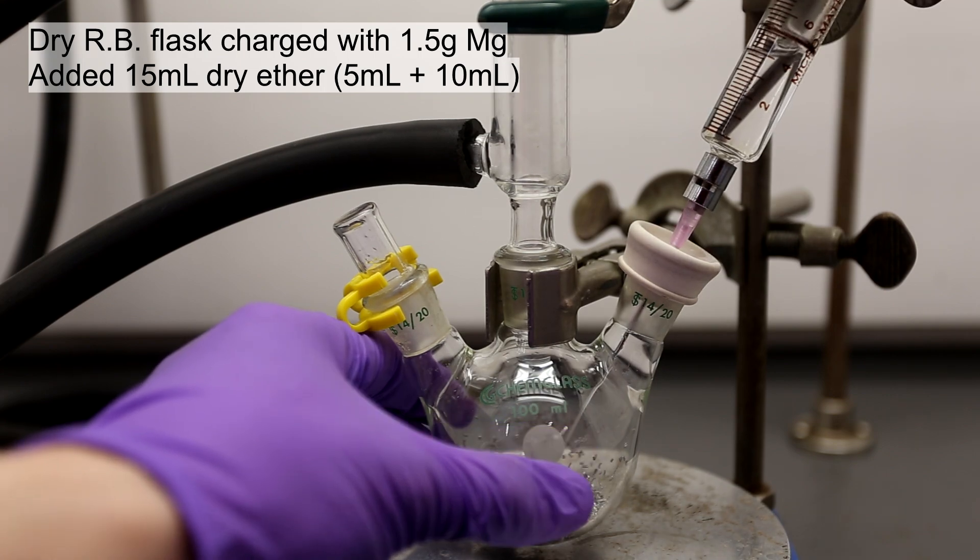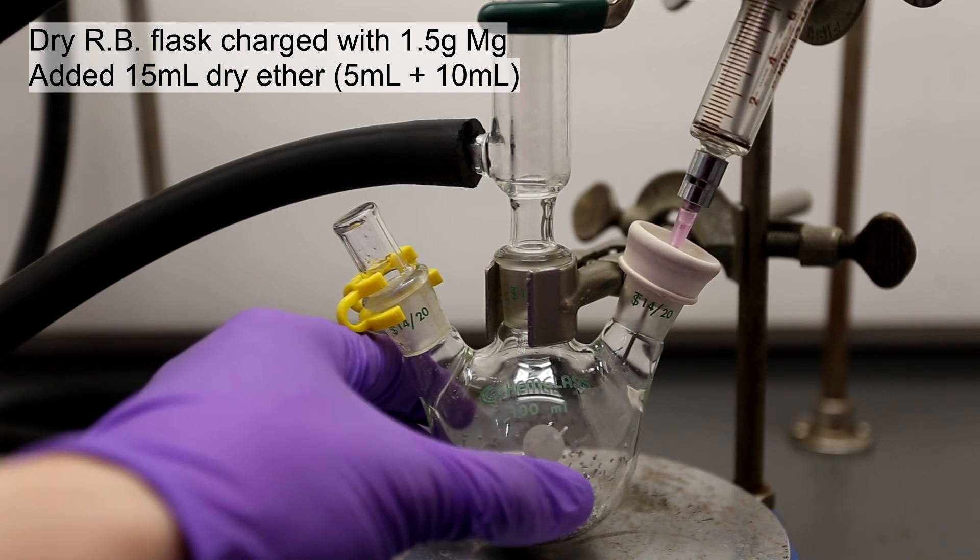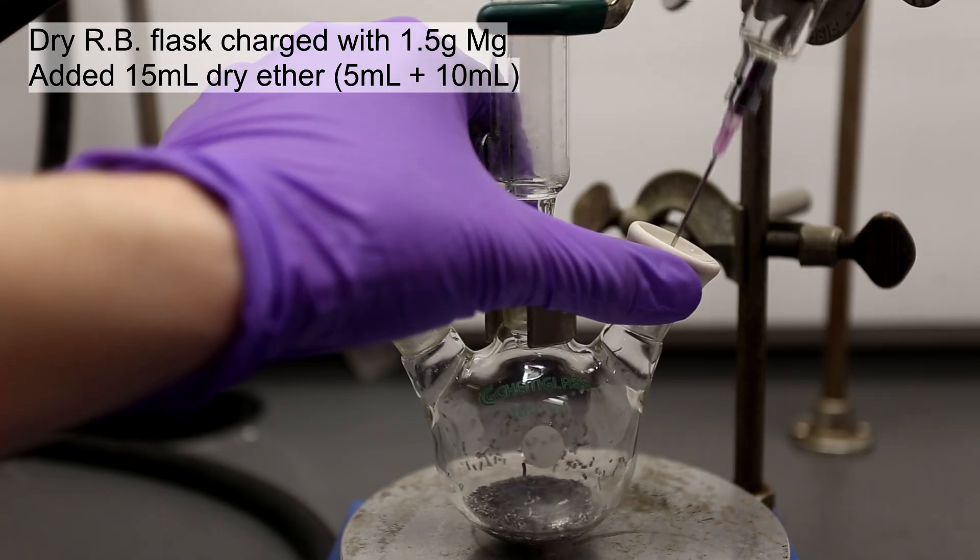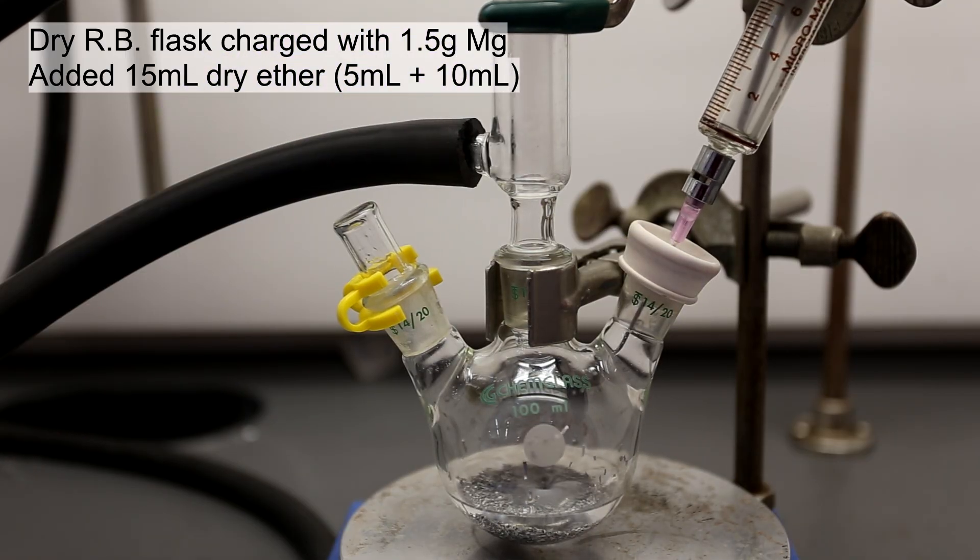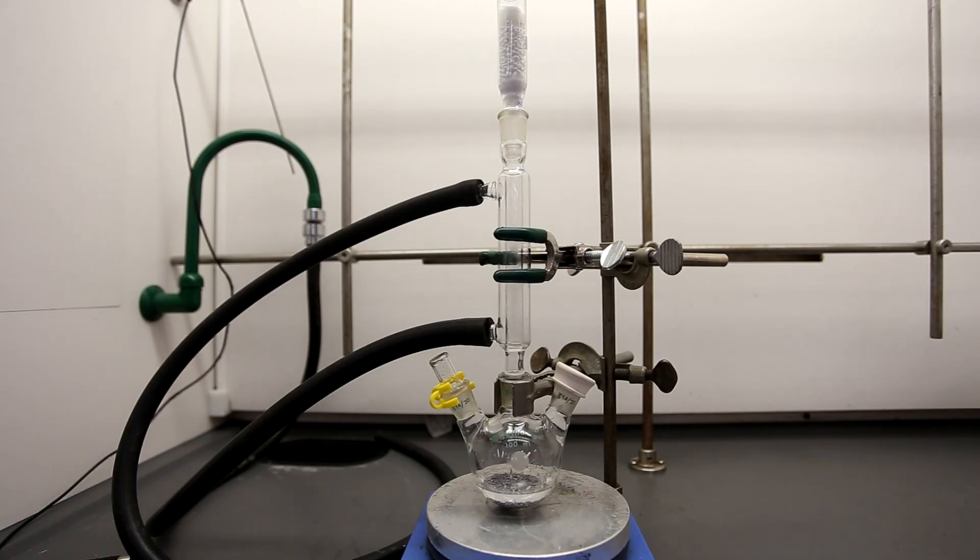An oven-dried, three-necked round-bottom flask was charged with 1.5 grams of magnesium as well as 15 milliliters of dry ether. The apparatus is closed from the atmosphere and a drying tube is at the top of the condenser column.